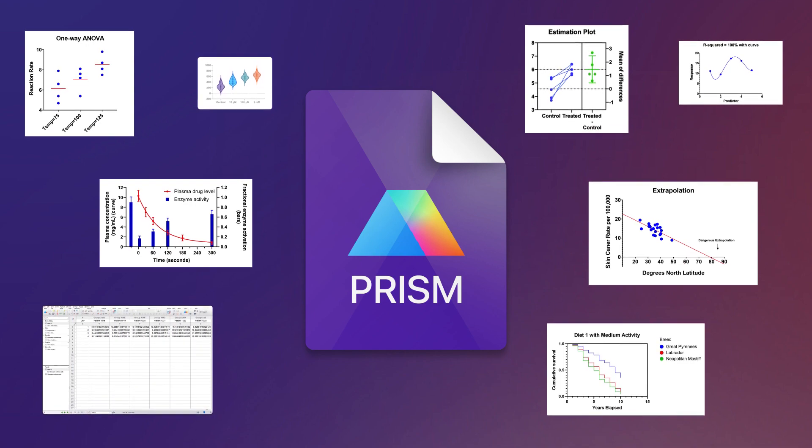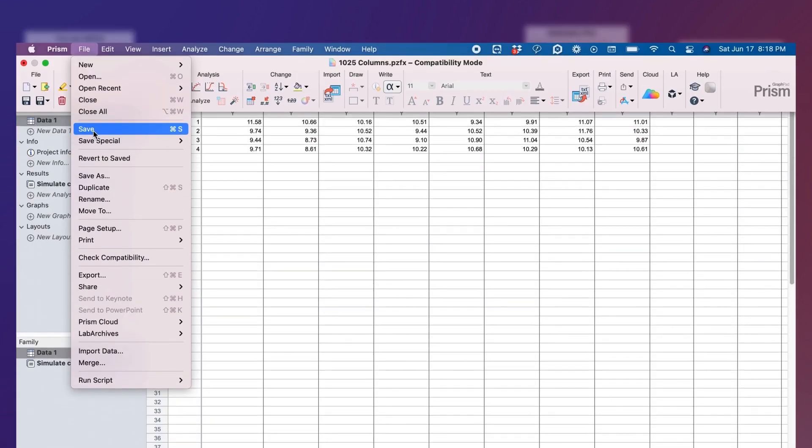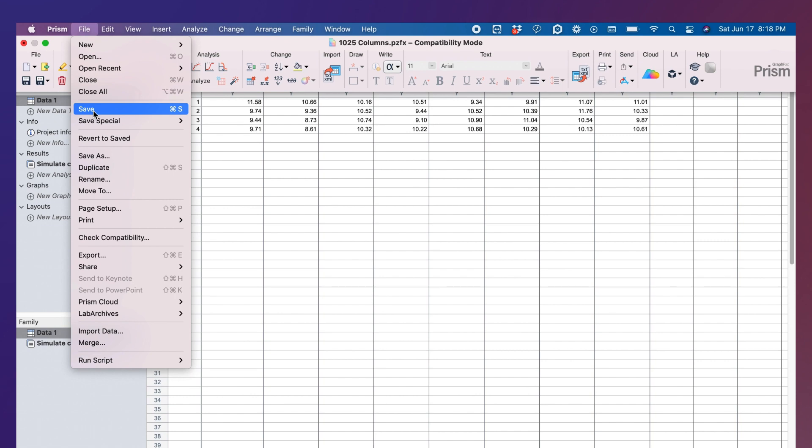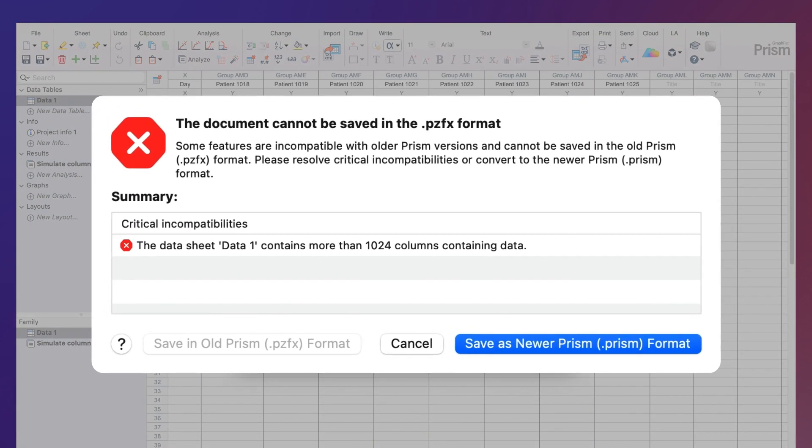10's new features and functionality. When you're ready to save, PRISM will automatically run a compatibility check to see if you can save the file back to its original format, or if you'll need to save it as the new .PRISM format.